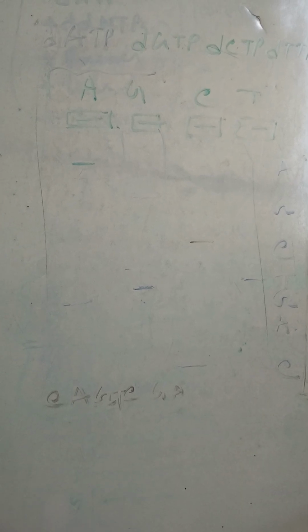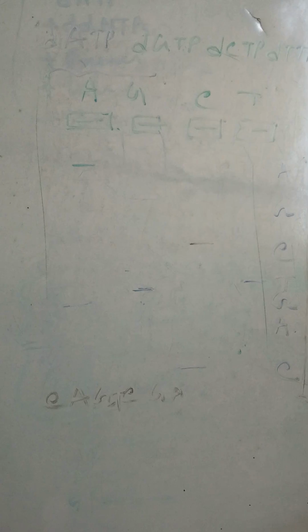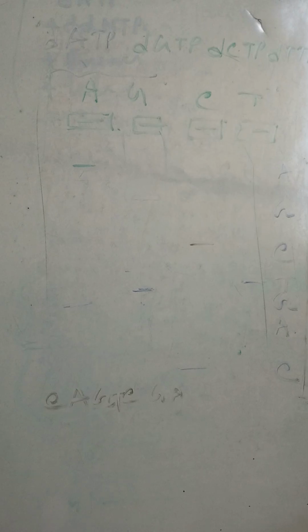So this is the easiest way I am trying to make you guys understand, but it is not so easy. There are computer generated softwares that will read it in the end. So in this way the Sanger sequencing process works.